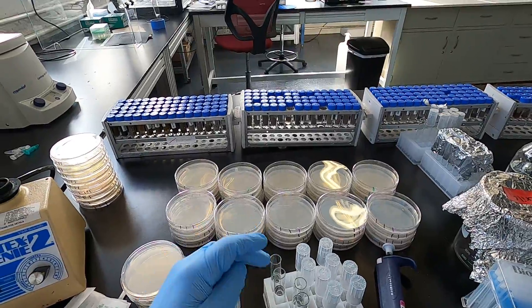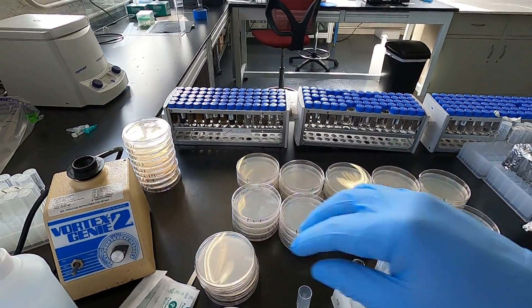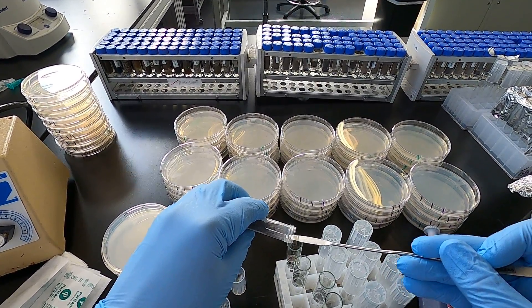We'll start with our 10 to the zero tube, 10 to the negative one, 10 to the negative two, and 10 to the negative three. Some people go lower; however, you rarely see enough cells on the plates to make it worth it.